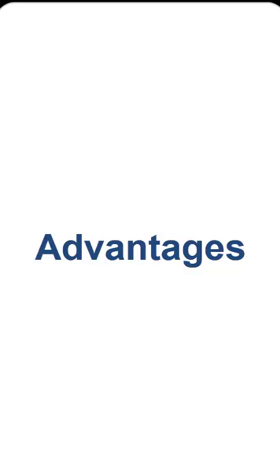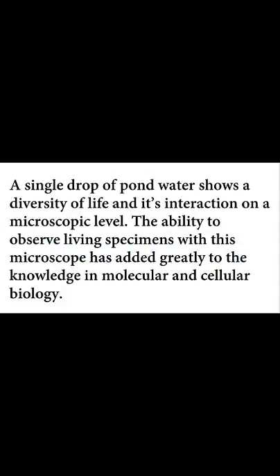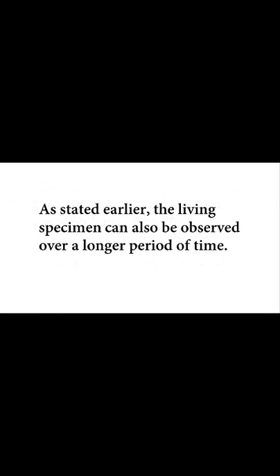Advantages. A single drop of pond water shows a diversity of life and its interaction on a microscopic level. The ability to observe living specimens with this microscope has added greatly to the knowledge in molecular and cellular biology. As stated earlier, the living specimen can also be observed over a longer period of time.